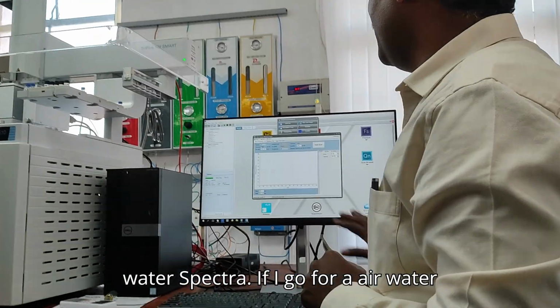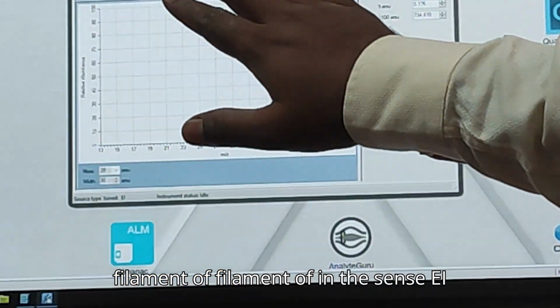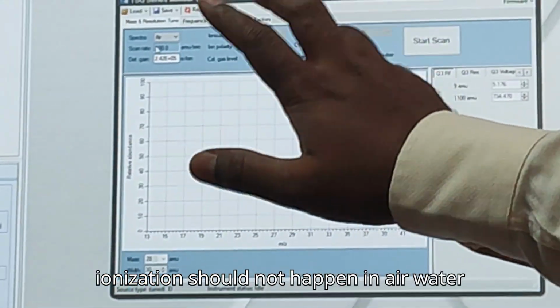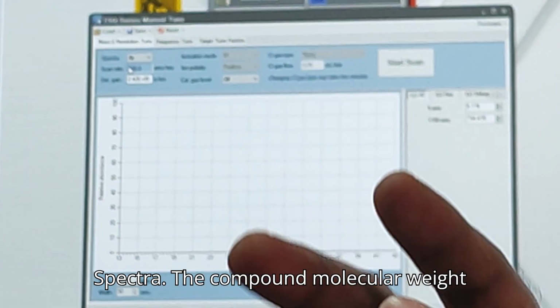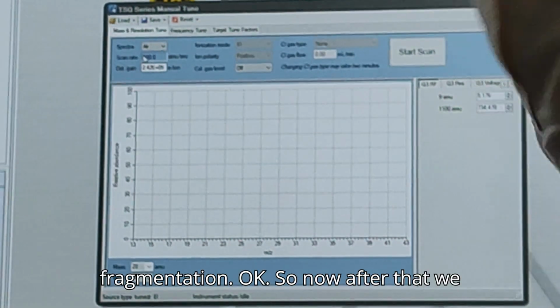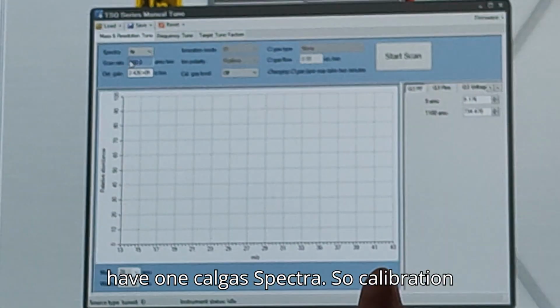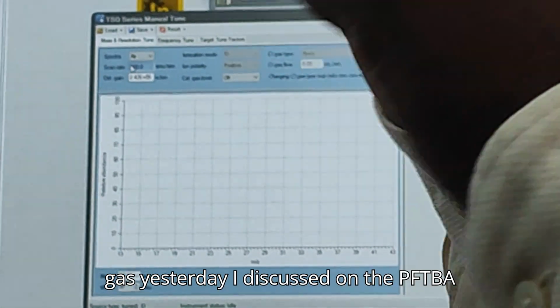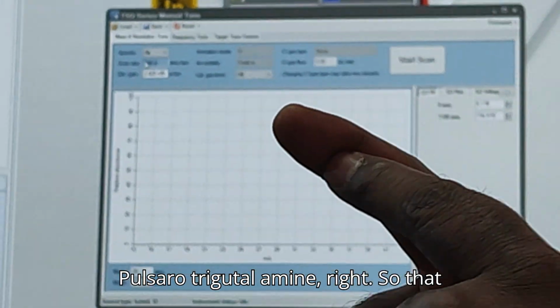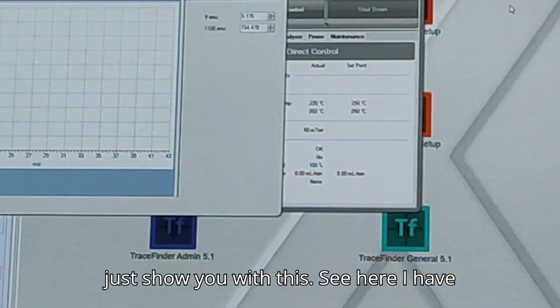If I go for an air water spectra, I have to keep the filament off. Filament off in the sense EI ionization should not happen. In air water spectra, the compound molecular weight as such will be identified, no fragmentation. After that we have one cal gas spectra. Calibration gas, yesterday I discussed PFTBA, perfluorotributylamine, right? That gives us some masses.